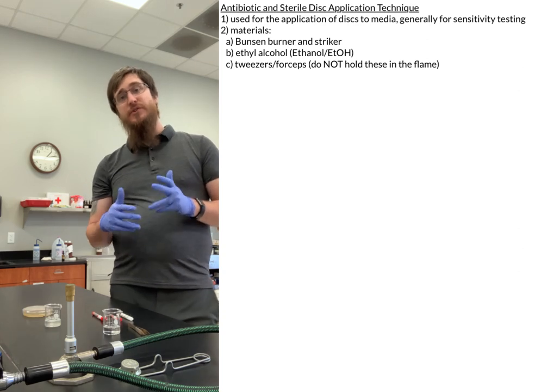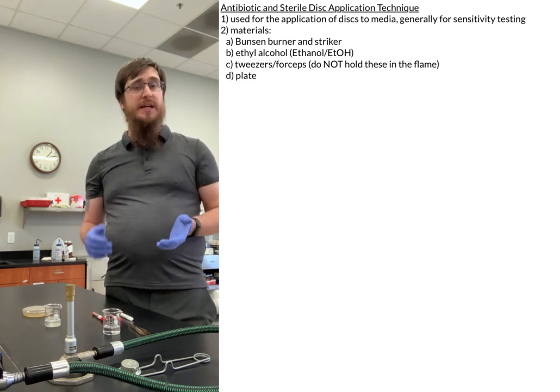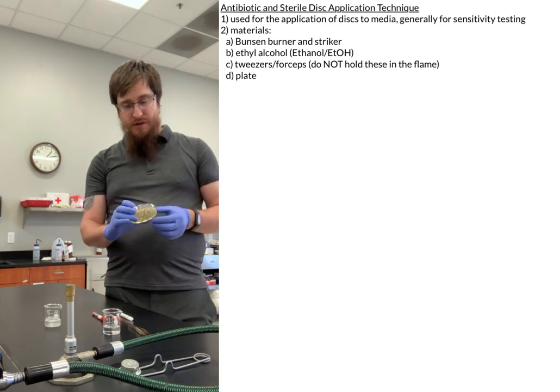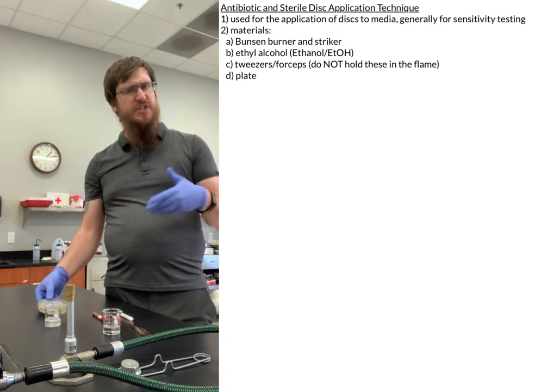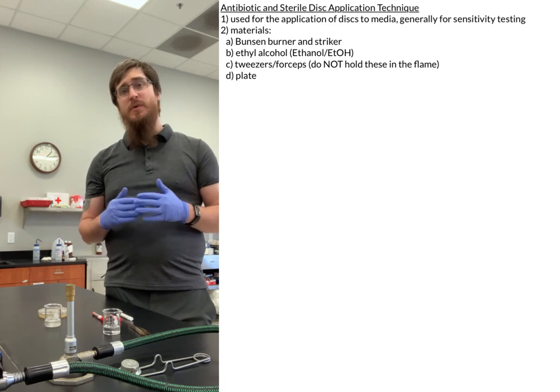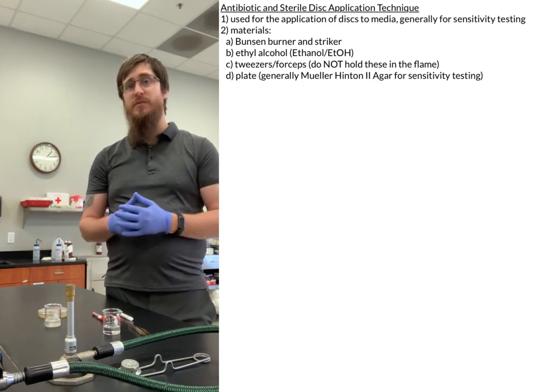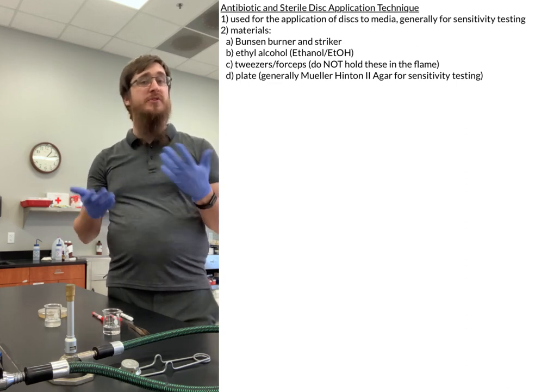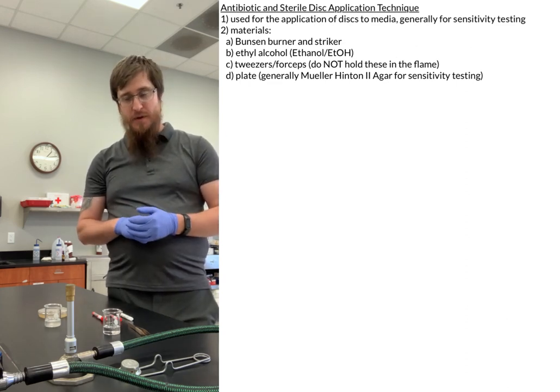You're also going to need a plate basically. You're going to need whatever plate that is that you're going to be putting your sample on. For sensitivity testing, again, which we generally do with this technique, it is going to be what we call a Mueller-Hinton 2 agar that we use, but depending on the specific lab that we're doing, we might be using different kinds of media as well.